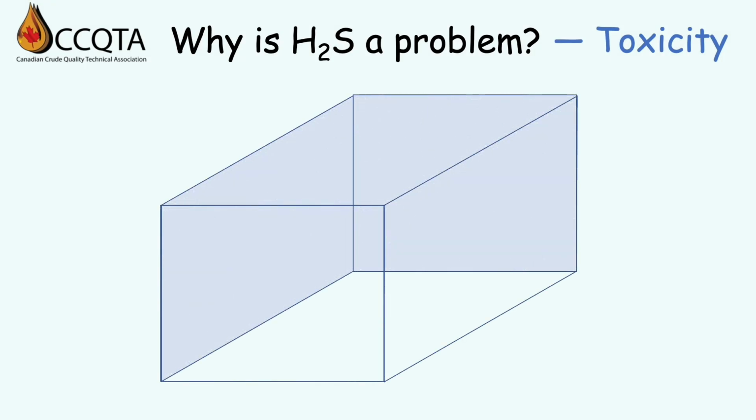Scenario 2. In a laboratory setting, a 1 liter crude oil sample is received. It has a warning that it contains 100 ppm of H2S. Some people look at that number and remember their H2S safety training and immediately assume it will be toxic to handle. What is often overlooked is that the H2S source, in this case the sample, has a finite quantity of H2S.